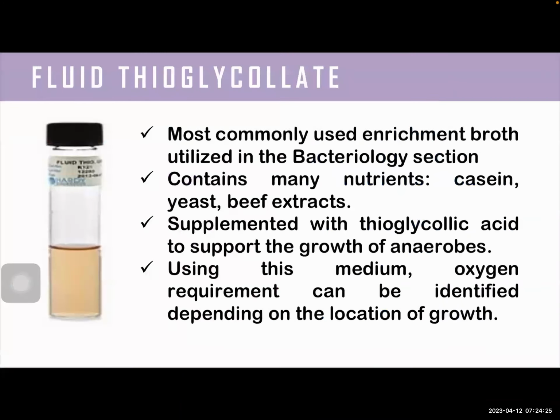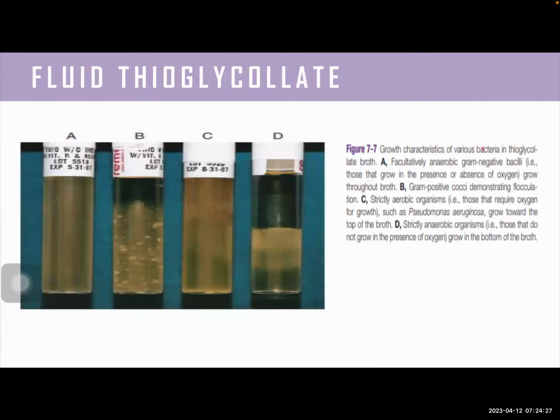By the way, I think I wasn't able to mention this. Kapag before mo inoculate, you need to boil it to, again, sterilize the culture, essentially. Another way of making sure that there is no contamination, iboboil mo muna yung culture. So how do we do that?